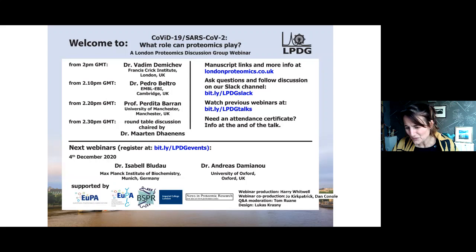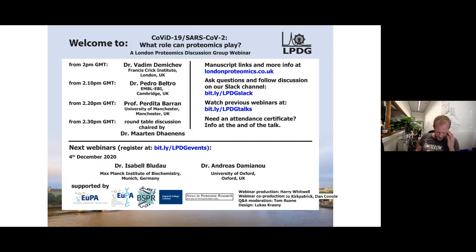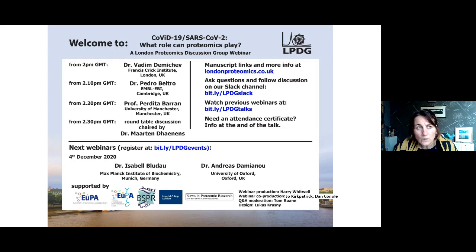Another issue still addressing you is whether you think enrichment is going to be a crucial part, and if it is, will that not be a very big hurdle for clinics to overcome? So at the moment, we're trying to make as minimal a method as possible, but we are considering enrichment, as I've said. One of the ways I think we may use enrichment, or a possible way, would be to do it in the kit, in the sampling kit. So let's see if the people can get that sort of thing to work. So we want to minimize the steps, and absolutely it is right. If we're going to take this into clinical laboratories, they want it to be something that can be handled by, you know, a technical grade routine analyst. And that's actually a really great scientific challenge to try and get something to work like that. I think we can. That's why we've got so many people working on it.